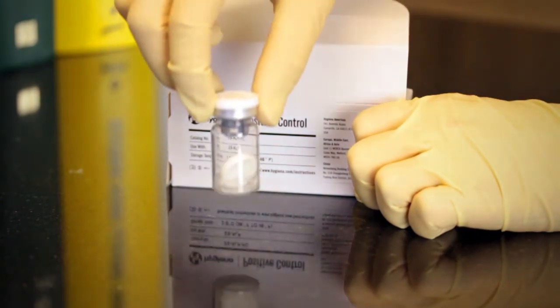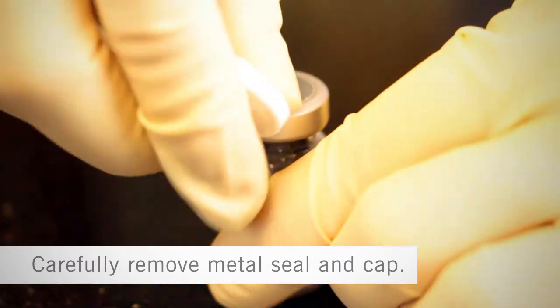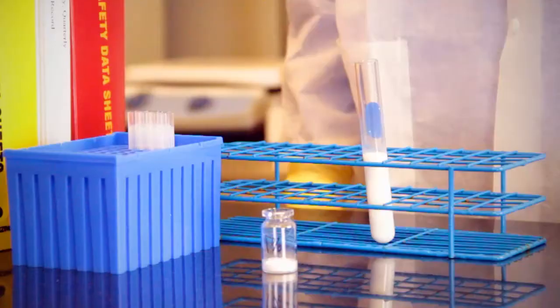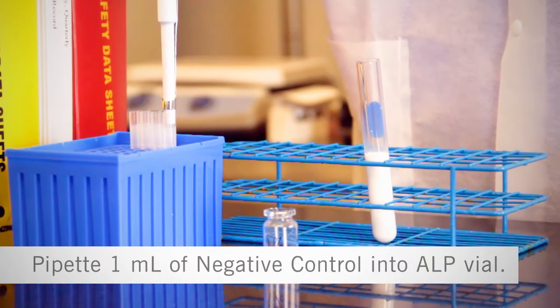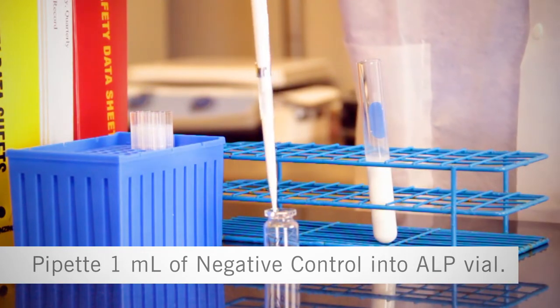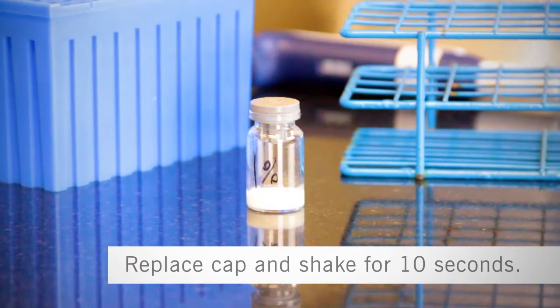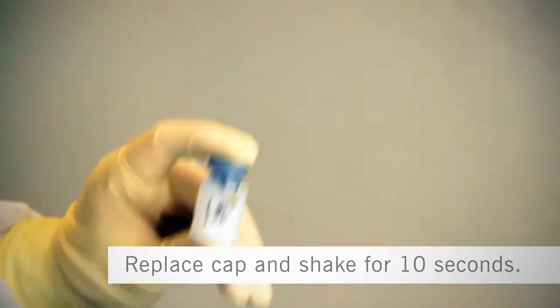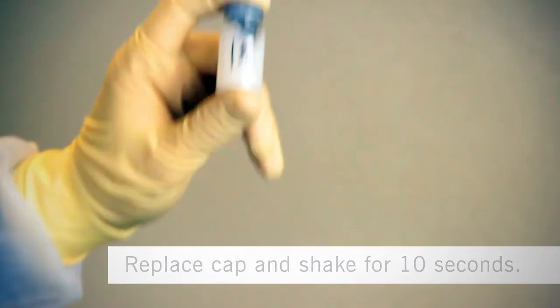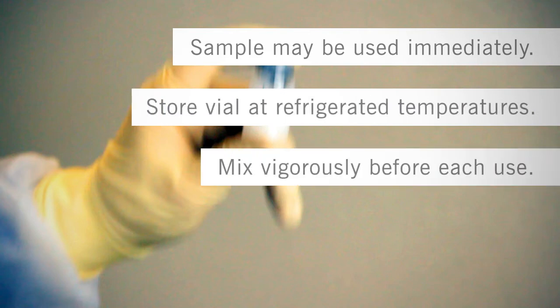Step 2: Preparing the positive control. Label each positive control kit ALP vial with the milk type to be tested. Carefully remove the metal seal and cap. Pipet 1 milliliter of negative control made from the milk type to be tested into the ALP vial. Replace the cap and shake vigorously for 10 seconds to mix the contents until completely dissolved. The sample may be used immediately or stored at refrigerated temperatures for up to 7 days. Be sure to mix the vial vigorously before each use.